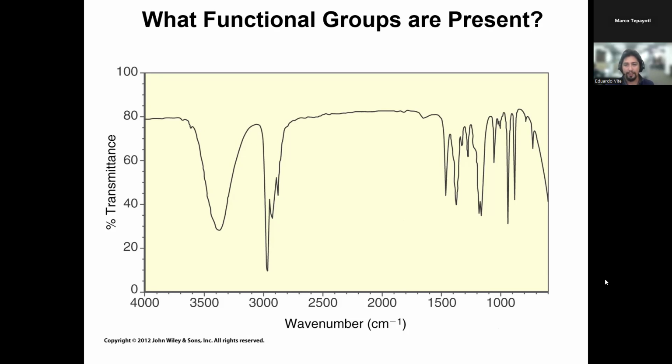How do we find the peaks again? You look at the spectra, and whatever is sharp and down at the bottom is considered a peak. If your question is how do you know what peak it is, there are always tables you can reference that tell you what functional group vibrates at what wave number and therefore what peaks. Zane said amine. This is not an amine because you can see the absorption is very strong compared to the amine. It is a very, very broad signal. Amines are usually a lot narrower and not as strong.